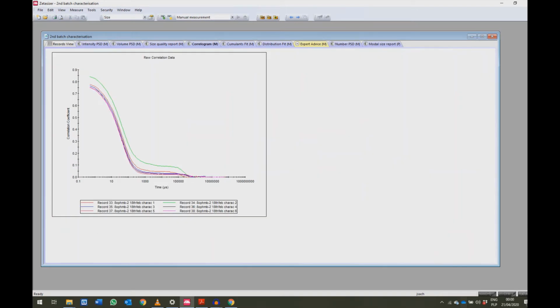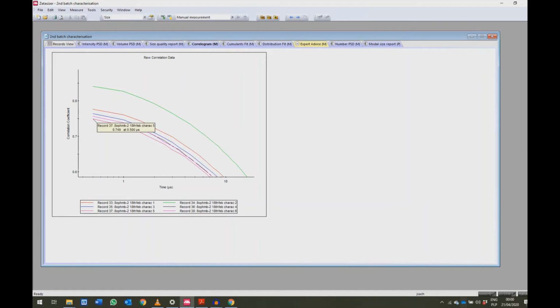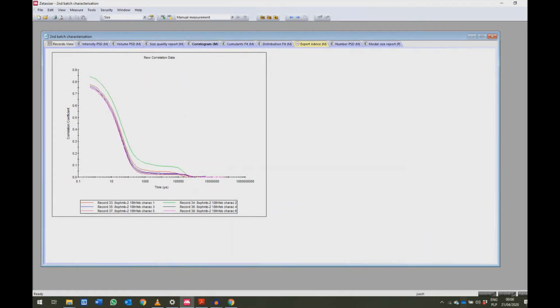So it could be that if there is a pattern of how this sample is reducing, for example, its intercept, or increasing the intercept, there might be an indication that it's sedimenting, or it's aggregating, or that it is breaking up as well. So again, you need to look at this on an individual case-by-case basis and understand what is happening there.